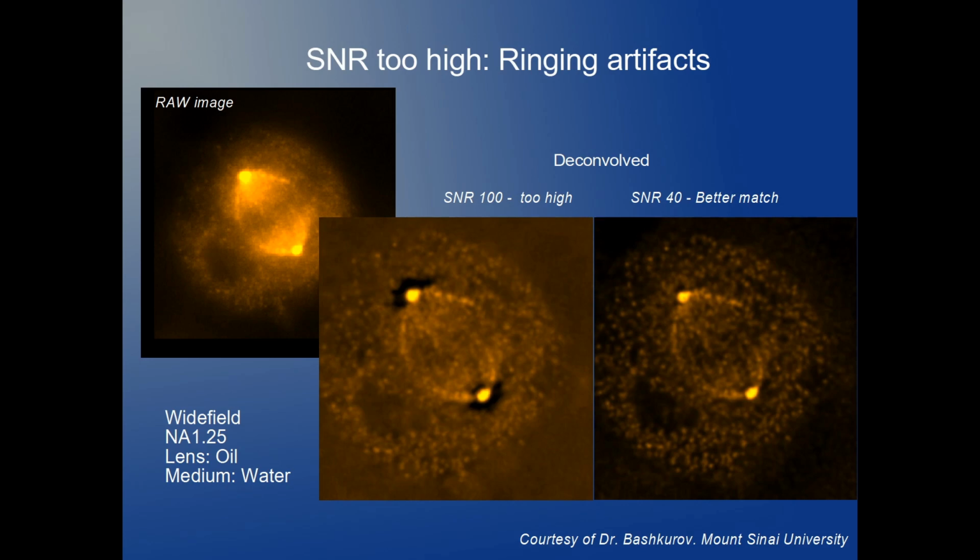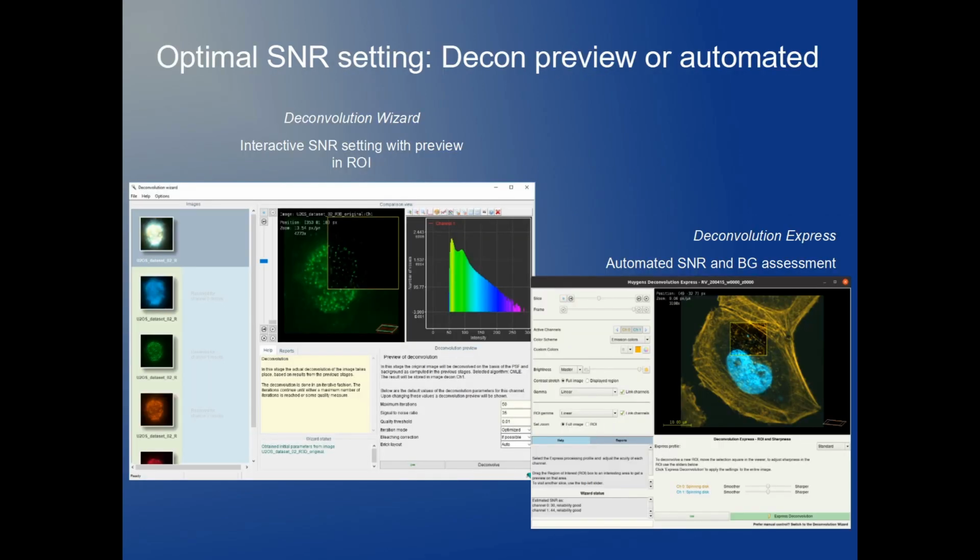So users find it difficult to determine how to set it. To summarize, until now in the Decon Wizard the SNR was changed manually by the user in order to smoothen or sharpen the decon result, and you could then use the Deconvolution preview button to see what the effect was on the image, but it was always up to the user how to do this.